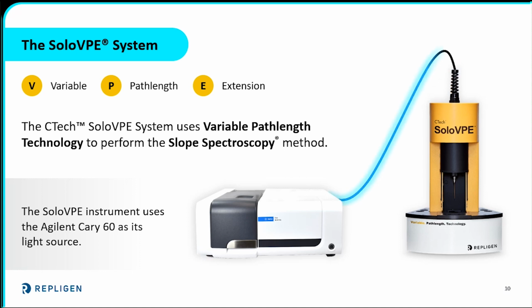So the SoloVPE system, which is a variable path length technology, utilizes the Cary 60 as its power and its light source. It does use a xenon flash lamp, so it is very powerful. It has a wide wavelength range of 190 to 1100 nanometers, and it has no warm-up time. So it is a very robust light source.